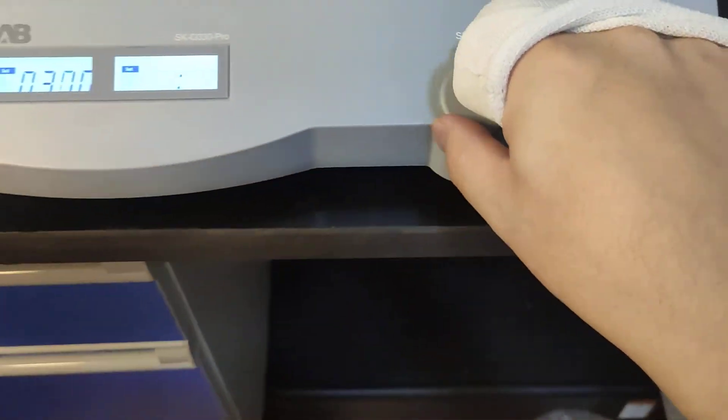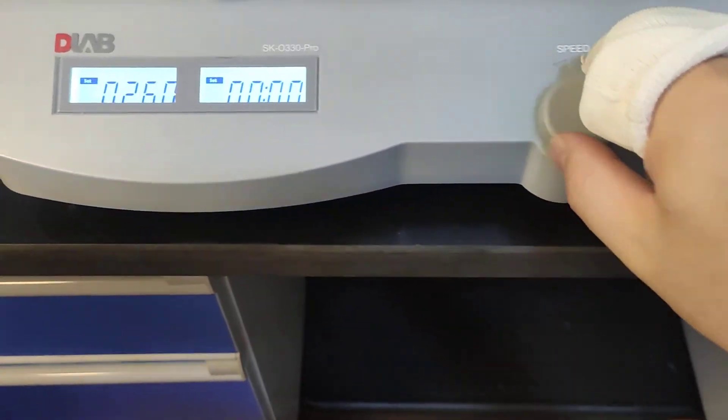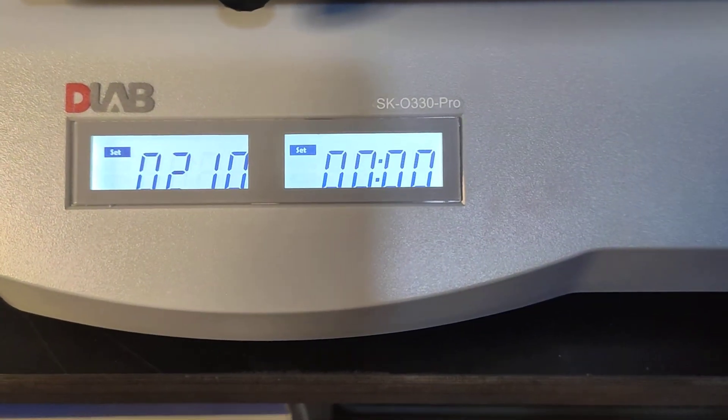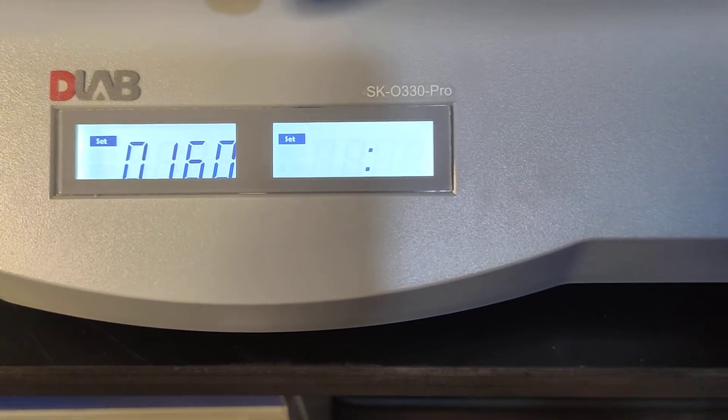If we twist to the left, the speed is decreasing.